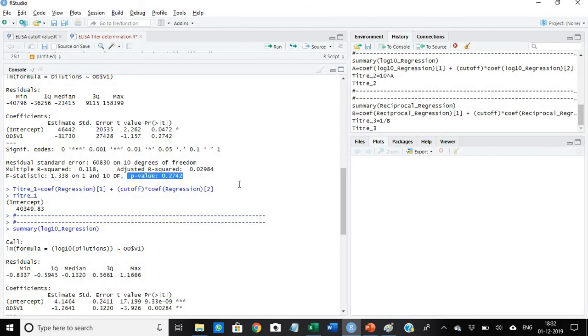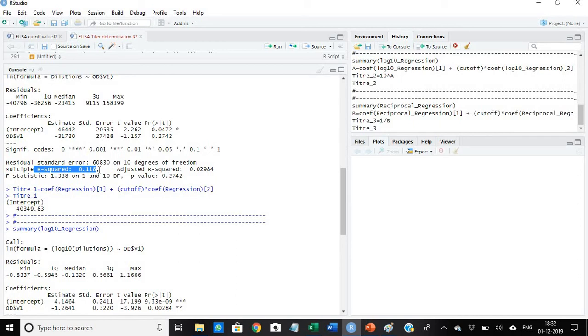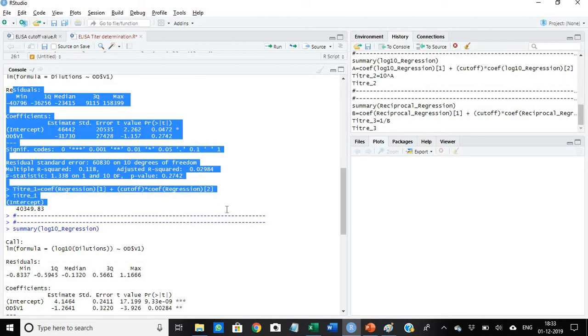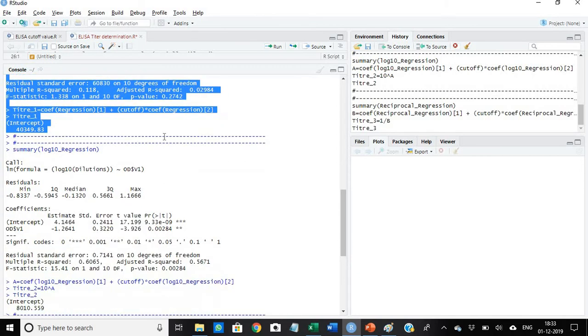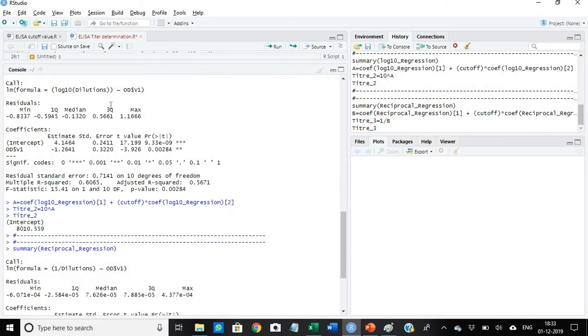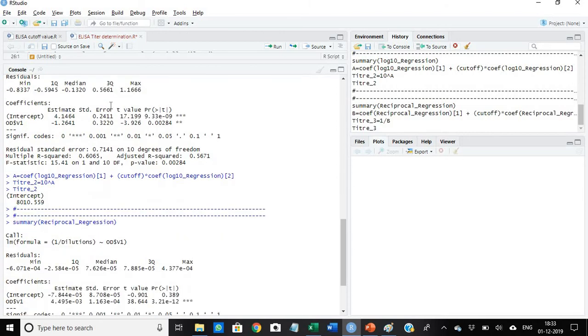The first regression is of the dilution and the OD value. We are to see the p-value. Secondly, we are to see the multiple r-square value. In both cases the r-square value should be above 0.7. It is 0.118 and the p-value should be less than 0.05, but here it is more than 0.05, so this particular regression is a failed regression. We cannot take it.